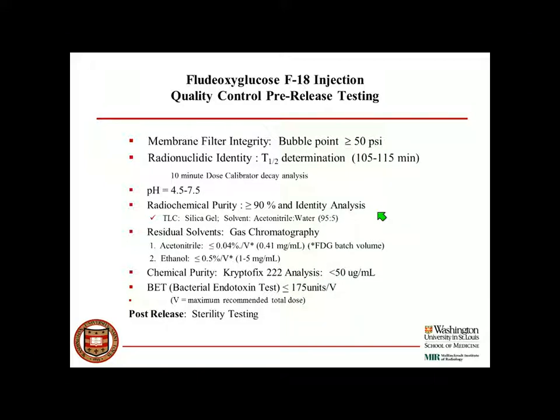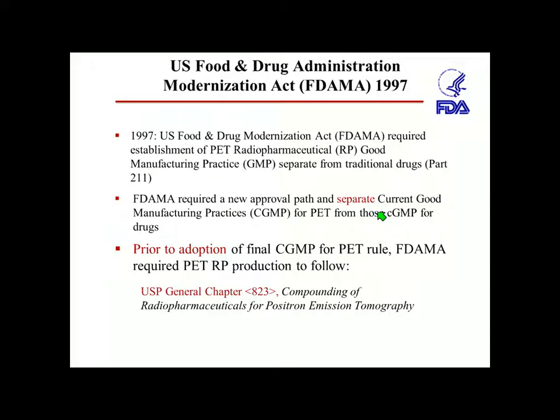In our institution, residents come in and just observe the process for the understanding of what it takes to get this product to you, because a lot of times things fail. And we're dealing with machines from the opening of our day at 3 a.m. until we deliver final product at 7. That's just one, but a lot can go wrong. And all of our QC instrumentation as well. We deal with high pressure liquid chromatography, gas chromatography. So again, it's really quite an undertaking to accomplish.